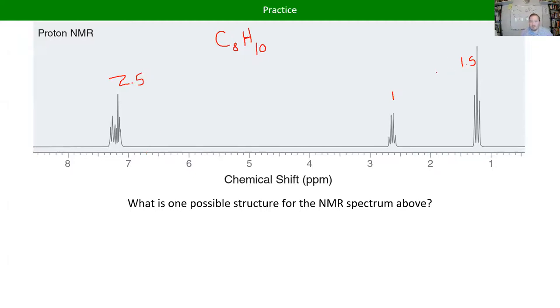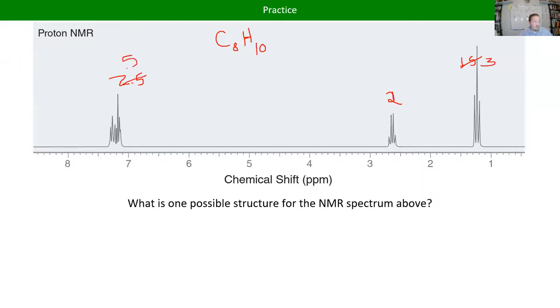You could start by fixing the integration to see if it tells you anything. We can't have part of a proton, so 1 and 1.5 and 2.5 need to be multiplied by 2. The other thing to notice is that your integration should add up to the total number of hydrogens in your formula. So this becomes 2, 3, and 5 — giving us a total of 10 hydrogens, which matches C8H10.